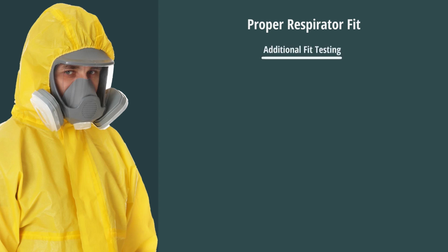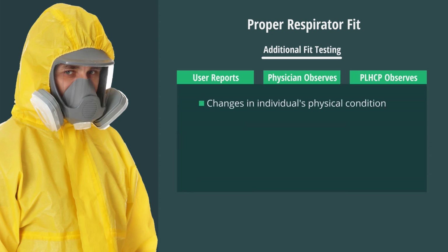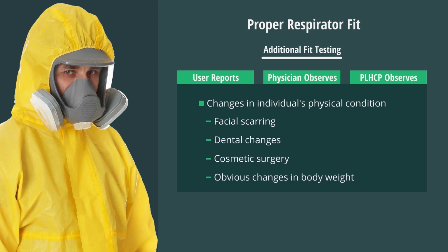An additional fit test must also be conducted whenever a user reports, or a physician or other licensed healthcare professional, known as PLHCP, makes visual observations of changes in the individual's physical condition, such as facial scarring, dental changes, cosmetic surgery, or obvious changes in body weight which could affect respirator fit. Testing is conducted to ensure that the respirator forms a proper seal to the individual's face.